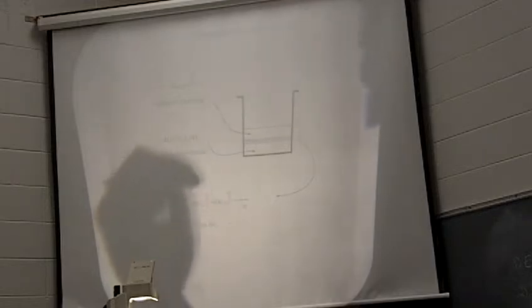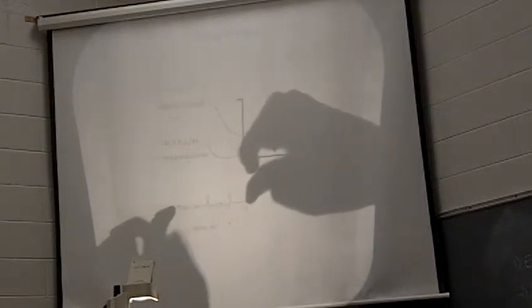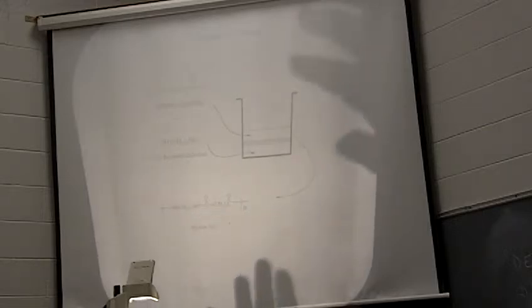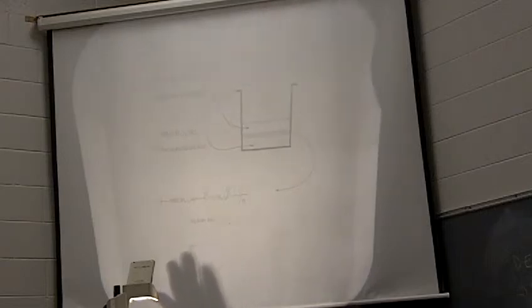I don't know if you've seen that demo before, where you put the two layers together and then you pull with a wire at the center, and that's the nylon being made at the interface of the adipoyl chloride and the hexanediamine. That nylon is then the alternating polymer, just alternating back and forth. Nylon fabrics and nylon pantyhose, things like that, are made in a similar fashion. The combination of the two things gives it its rigidity as well as its stretchiness.